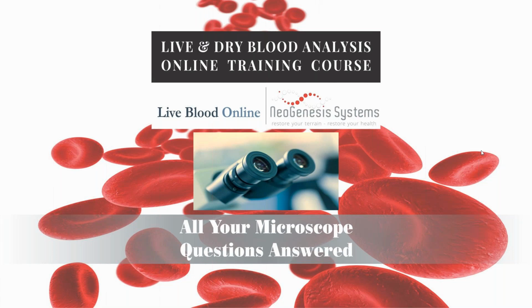Okay, and we've put these two questions together. One is, do these microscopes have phase contrast? And two, why don't you use phase contrast? Right, fantastic. So yeah, the microscopes don't have phase contrast as an option on them.